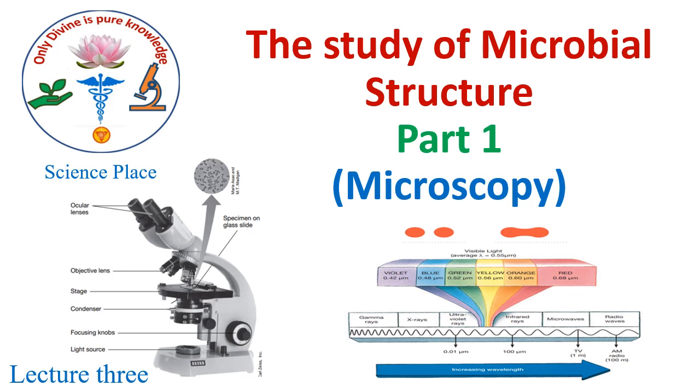Today we are going to see about the study of microbial structure. And to study the microbial structure, the first thing is to see the microbial structure. To see the microbial structure, what we need is a microscope. So let's begin. What is microscopy and how does it work?